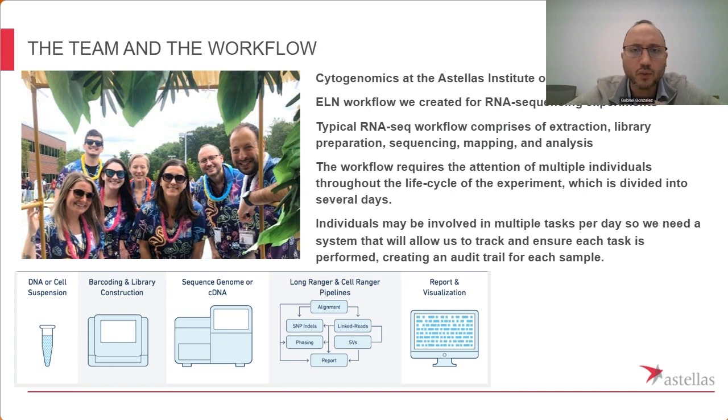So the workflow really requires a lot of attention. Right now we are 8 people in our department, and the tasks are assigned: somebody is going to be doing the library prep part of the experiment, and maybe another team member is going to be assigned the sequencing part. Another team member will be assigned the mapping and the transferring of the reads into our cluster, and then another person will be assigned analysis.